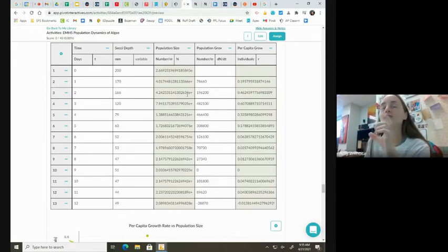So you can, if you want, do all this and divide it by the population size and do all that, but it's going to come out to be right around when you hit carrying capacity what the growth rate was. So I just used 0.06, and I think they used 0.07. So I felt like I was pretty close to that. But so when we hit carrying capacity, so you look for carrying capacity, you do that, whatever the growth rate was on that date is approximately your maximum, because that's kind of when it was up that high slope, and it's like can't grow any faster than that, or else you'll run into things.